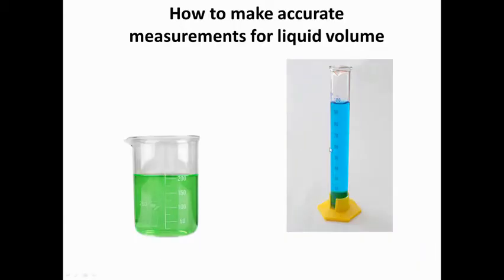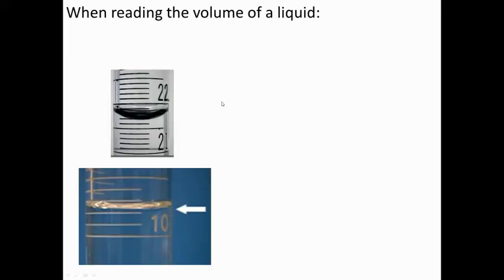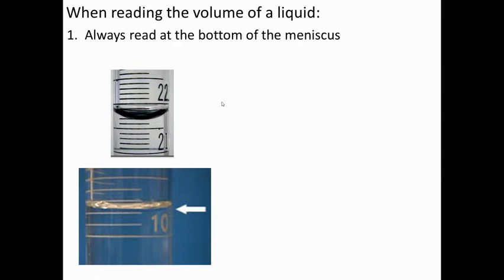So when you do have a container full of liquid, we need to make sure that you know how to measure the right way. So the first thing we want to say, you probably heard about this in middle school, is make sure that you always read at the bottom of the meniscus. Now, in case you're not clear, the meniscus is the curve that's created when water is inside one of these containers. If it's a very skinny container, then you're going to see a really pronounced curve like this. If it's a wider container, the meniscus is going to look more like a bubble. But either way, make sure that you measure to the bottom of the meniscus. That's where the majority of the water is, and that's where you're going to get the best reading.